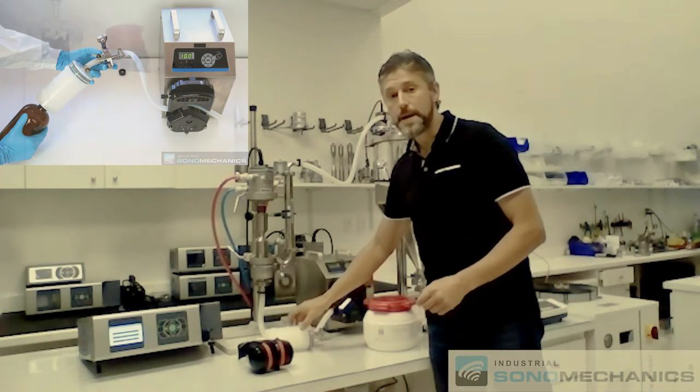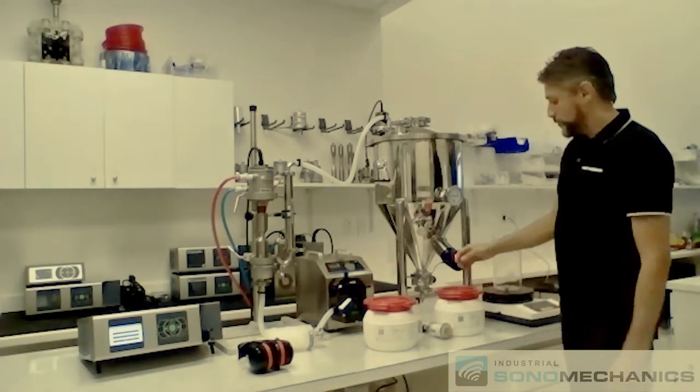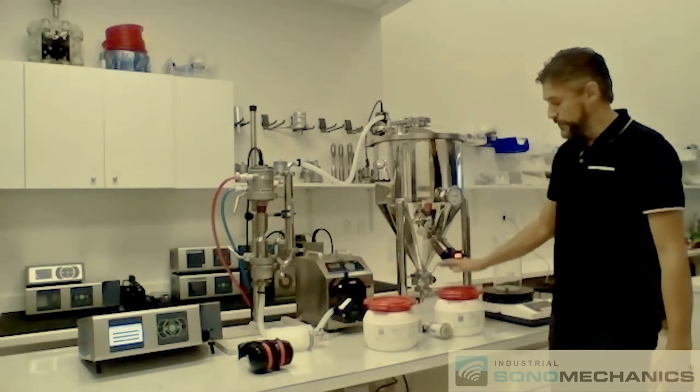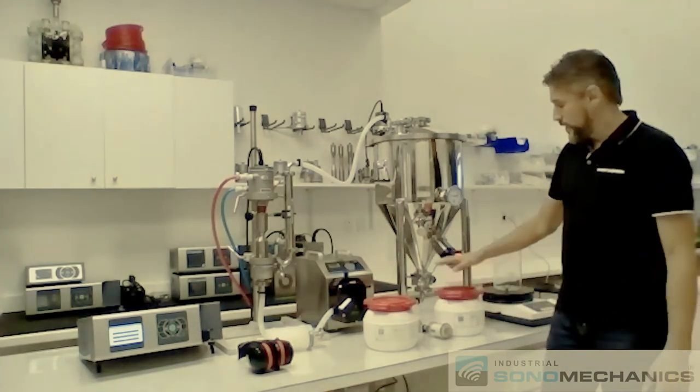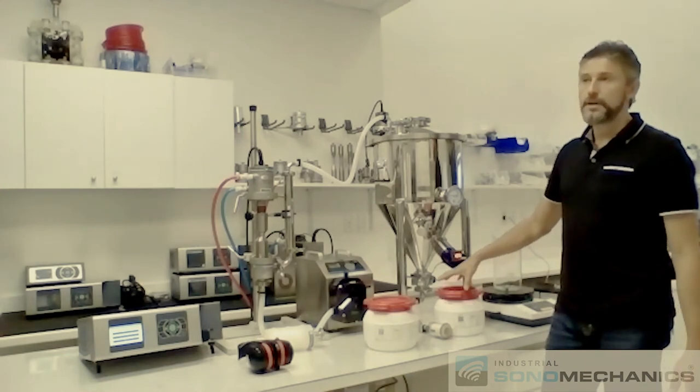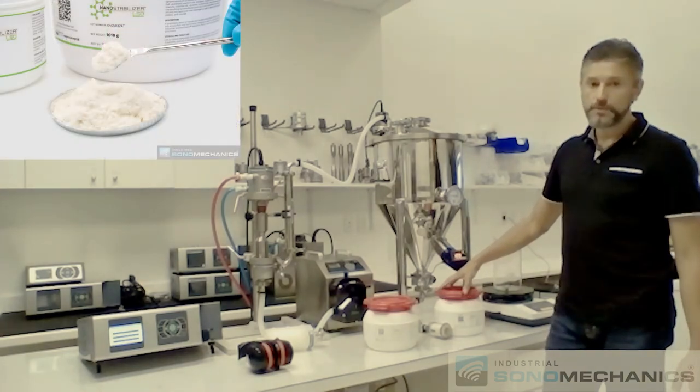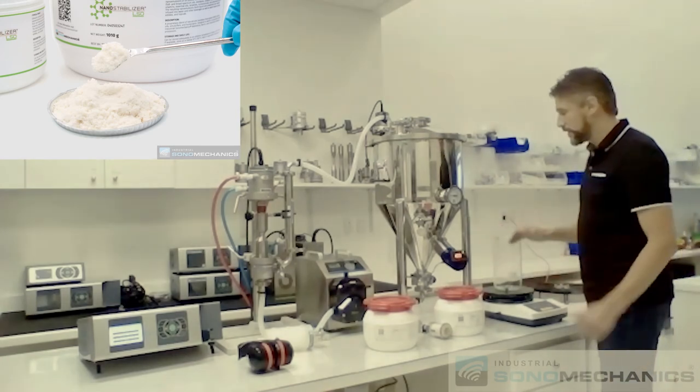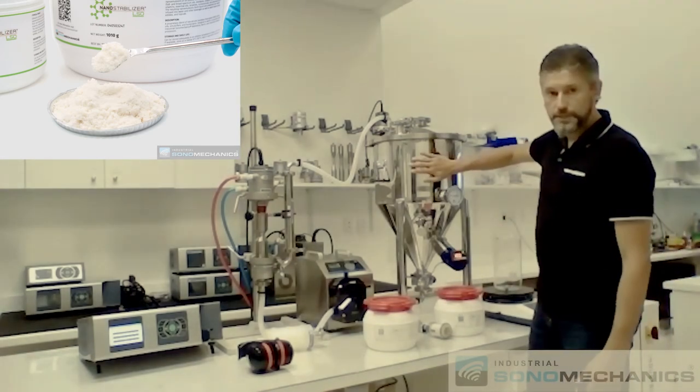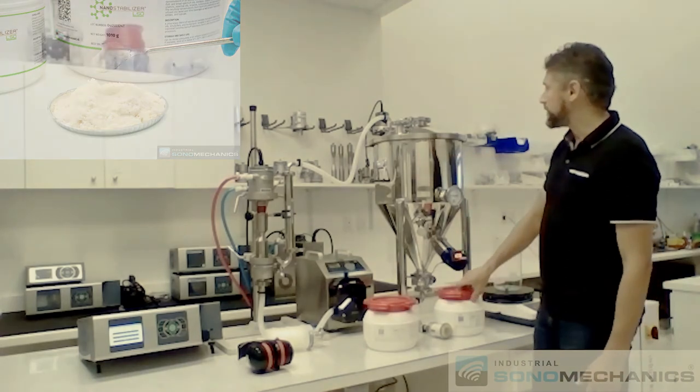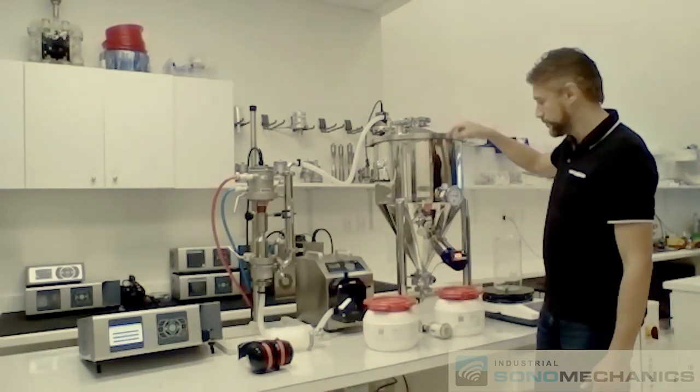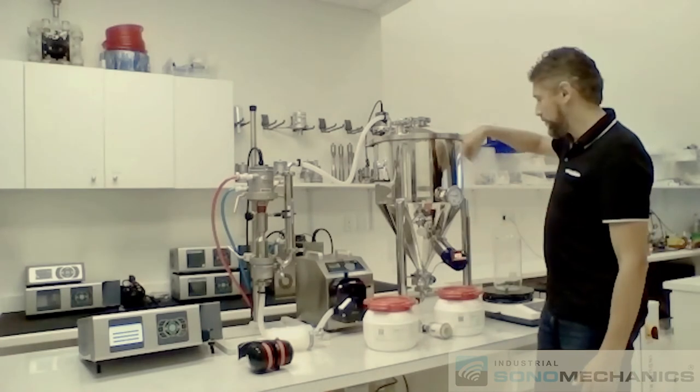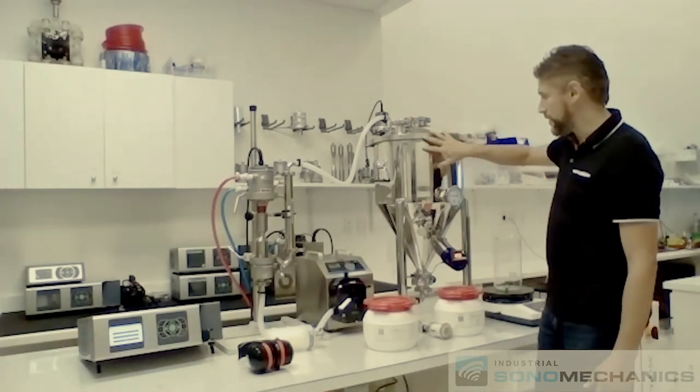Now, if you're making a powdered nanoemulsion, you will need a different type of nanostabilizer, nanostabilizer LSO. This is not a liquid. It's a powder. It will not melt. So we're not going to do any of this. We're not going to be pre-mixing. You have your water in this tank. After that, you place the appropriate amount of nanostabilizer LSO into this tank. The mixer will make sure that everything is homogeneously dispersed in there.